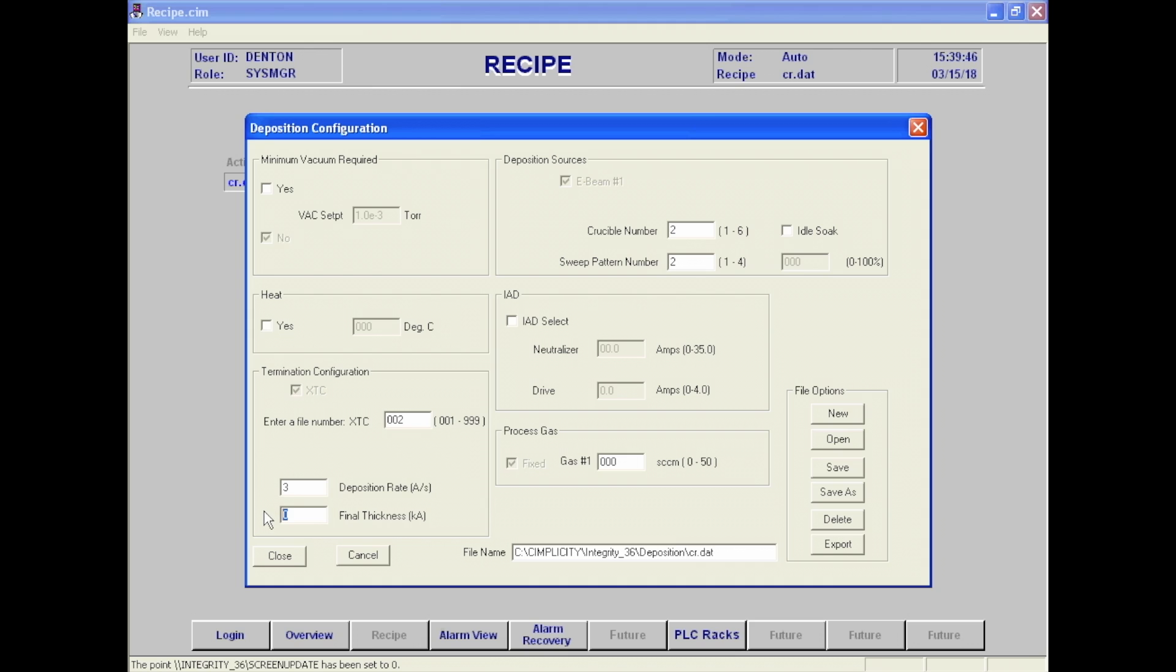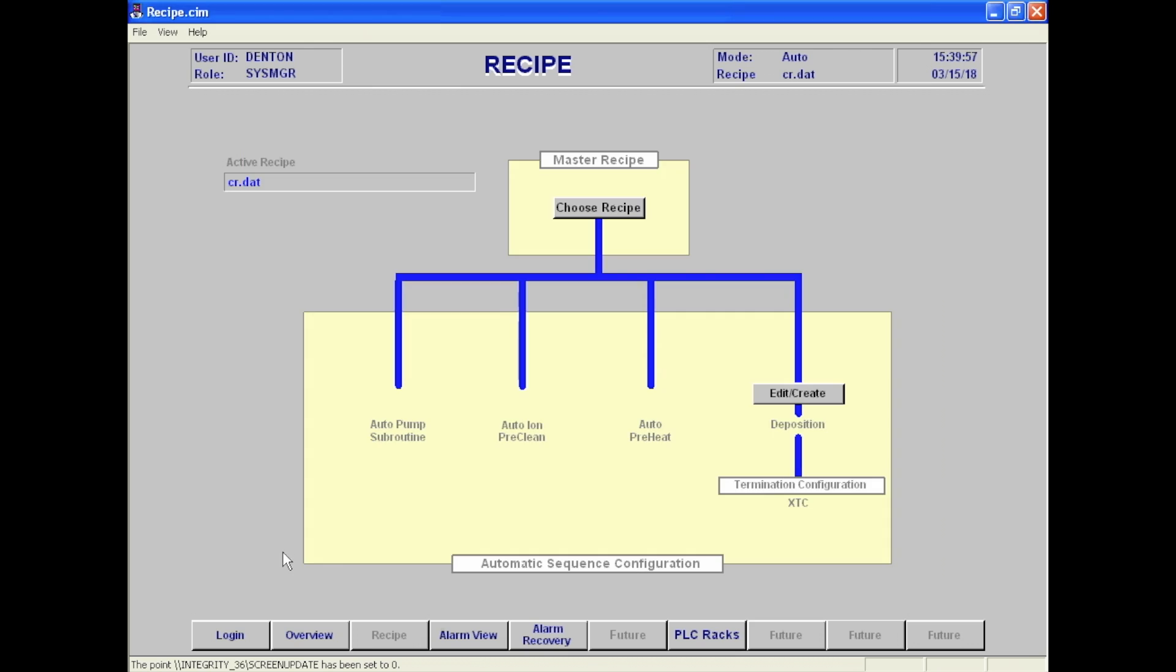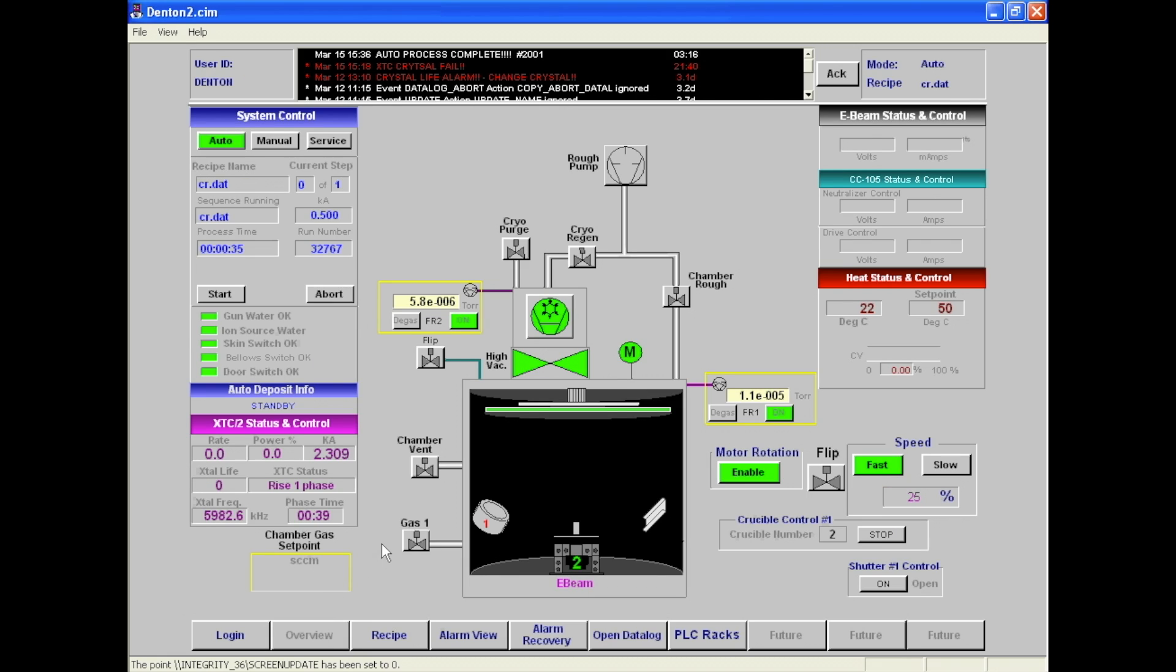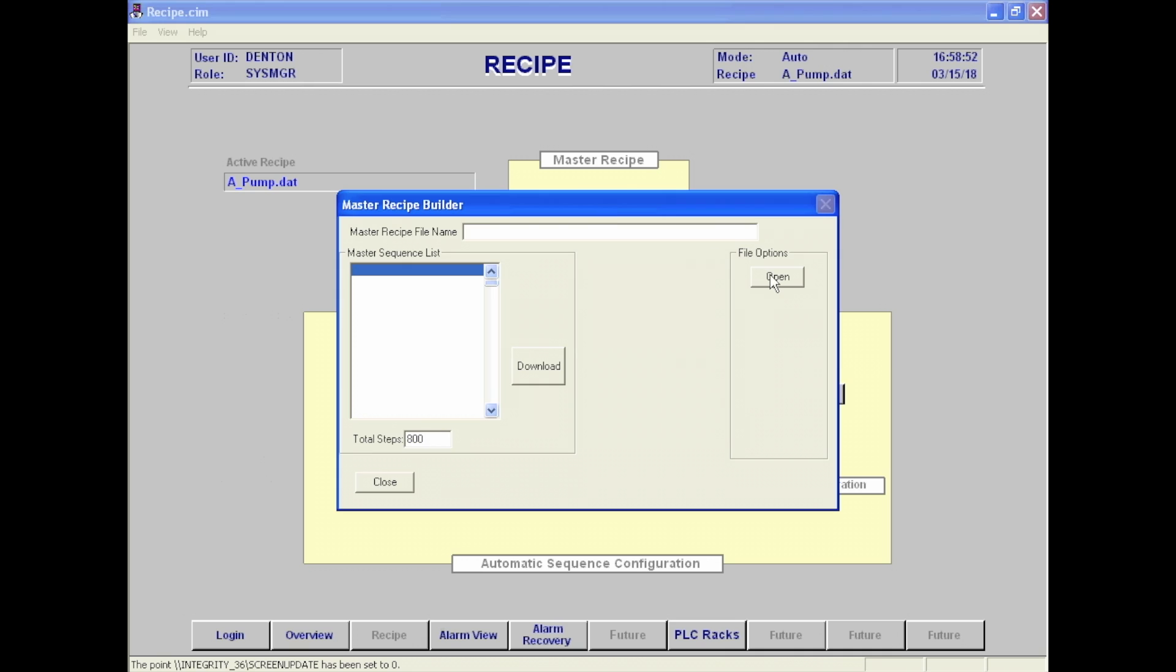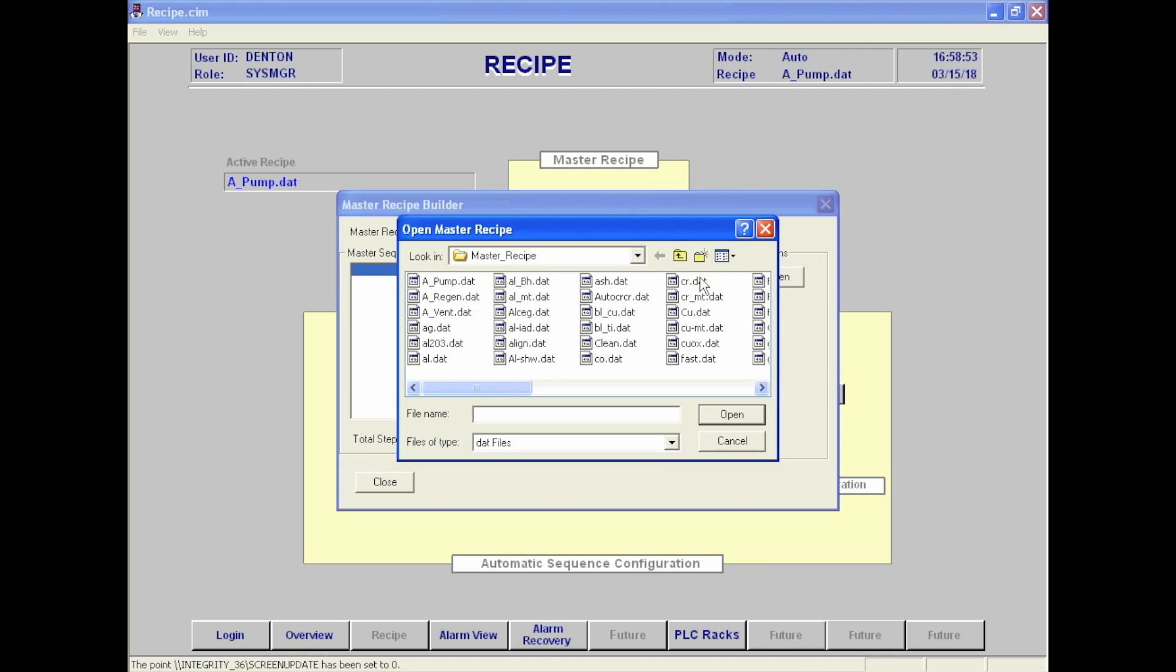Edit the deposition rate and final thickness for your run and click save. Open the recipe name that you just edited on master recipe. Download the recipe and hit close.